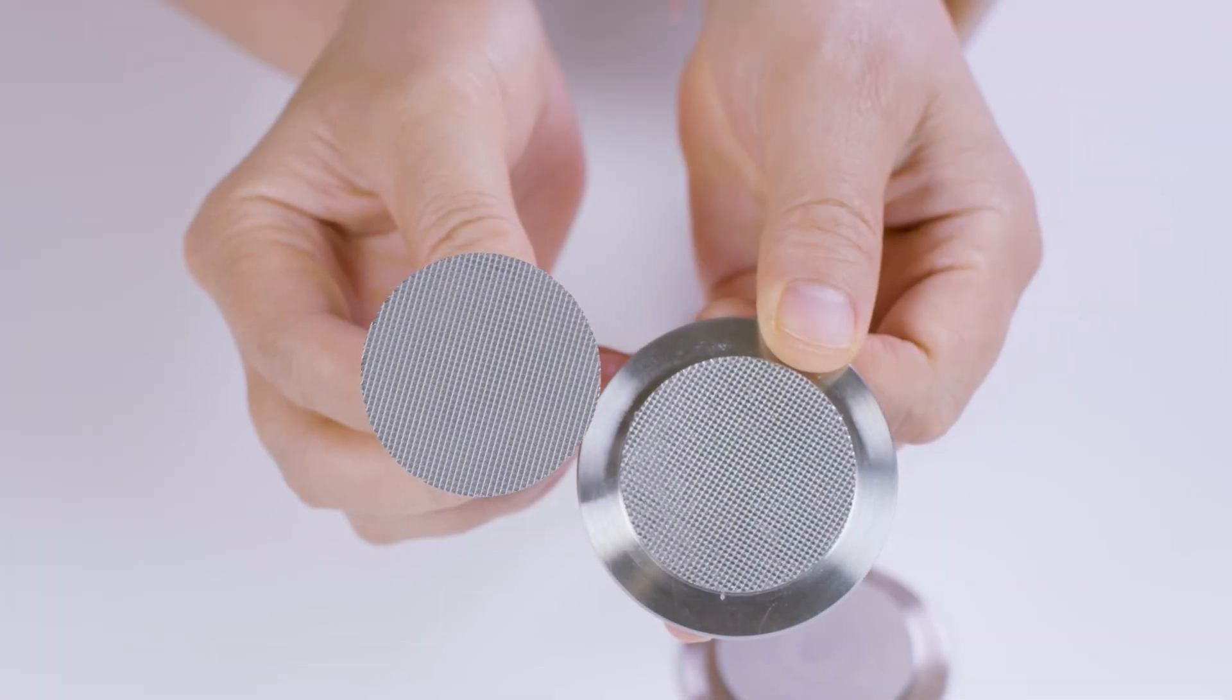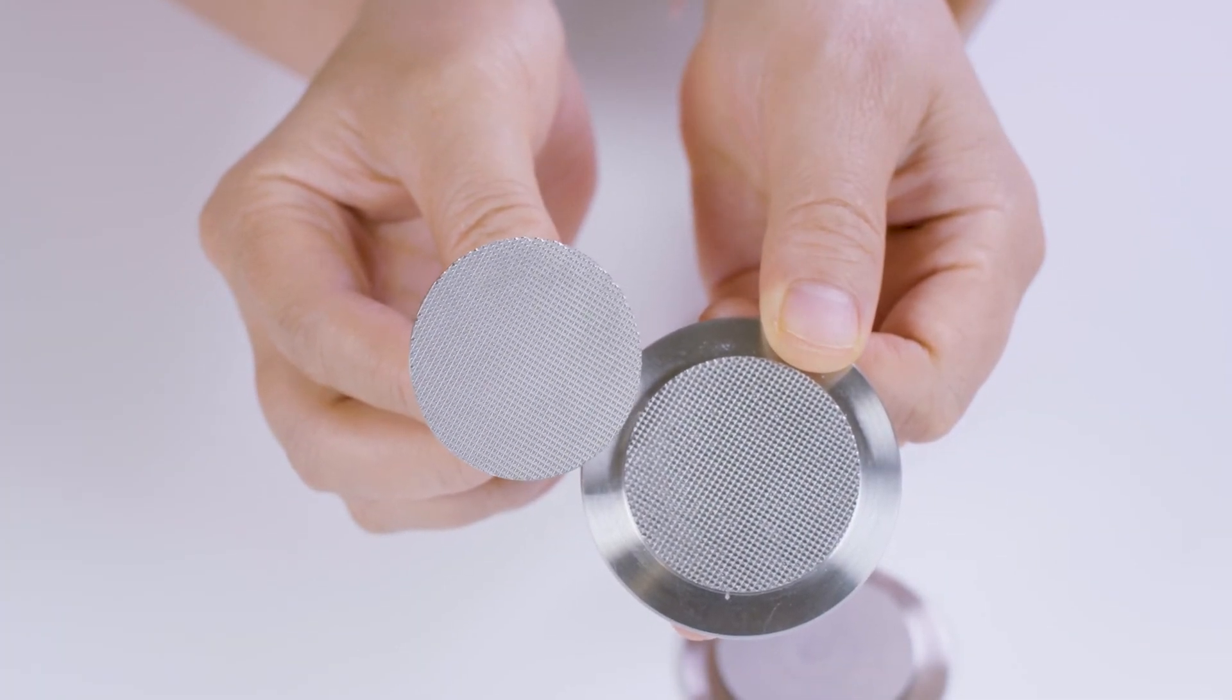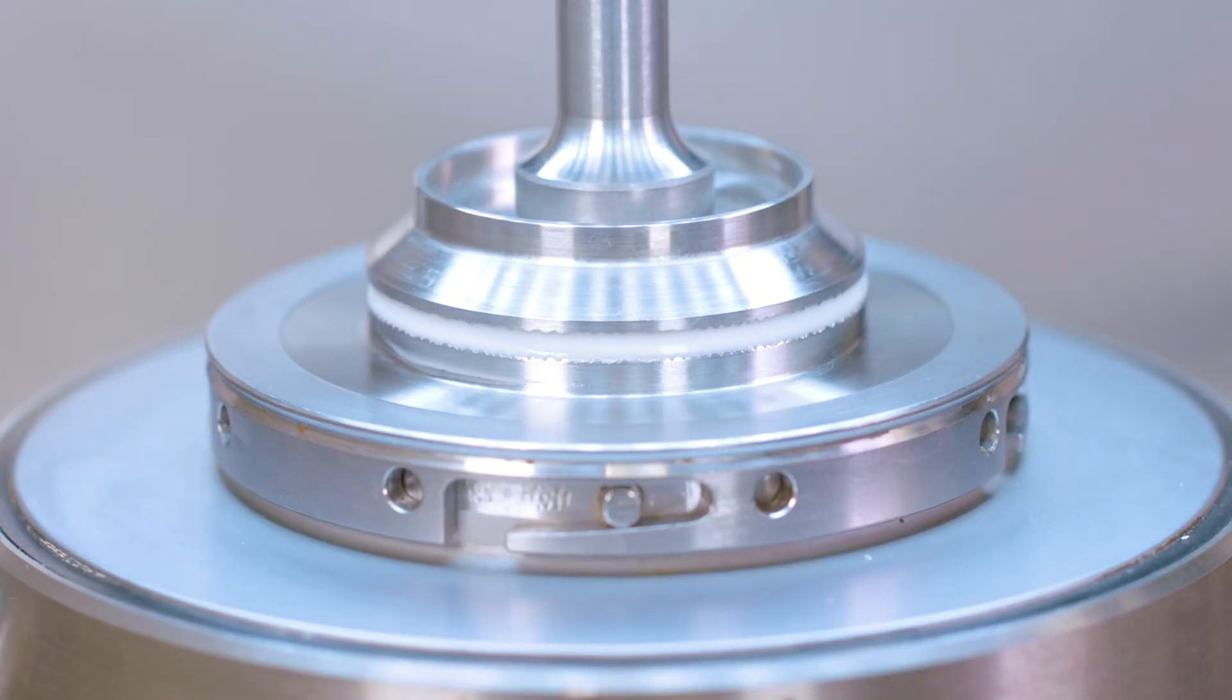The cross-hatched plate has even rougher surface texture. It is good for testing thick, paste-like samples such as toothpaste or cement slurries.